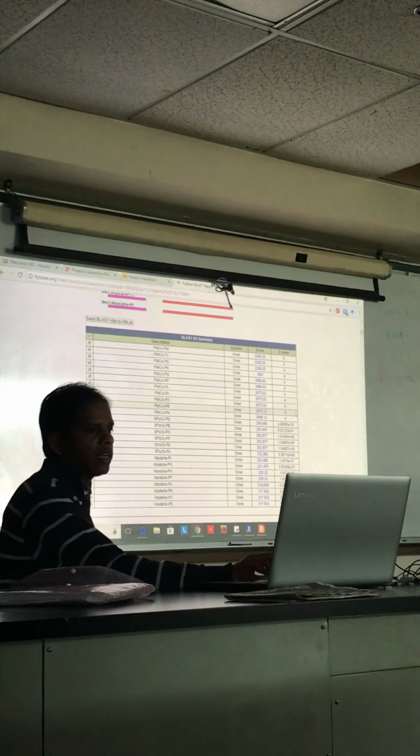Now we have to look deeper by analyzing each of the exons that has similarity, whether they have the same exon size, and whether they have the exact position of the splice acceptor and donor sites. Now put a copy of this series. Go to annotation PMCA, and then go to the GEP website. I'm going to go there, and then you go to Gene Record Finder this time. Gene Record Finder, and write PMCA.